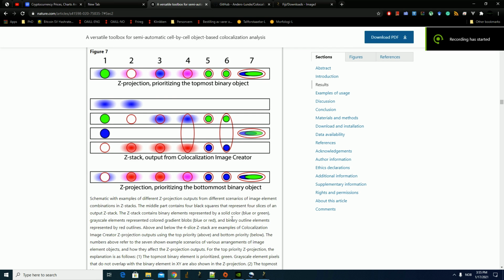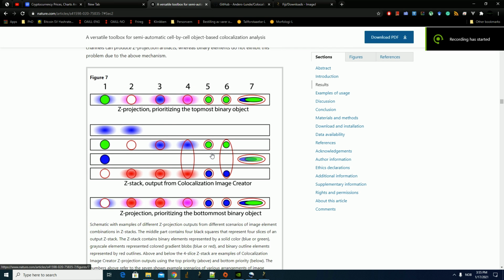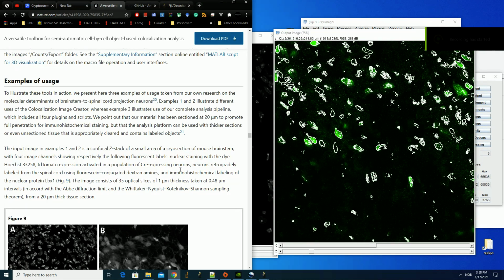And by the way, this is another reason for using mostly nuclear signals, because mostly they have less irregular shapes and different shapes than many cells might have in the cytosol. So if you stick to the nuclear signals, which we will mostly do, then you get less variability in size and shape. Okay, so let's look at some examples of usage.